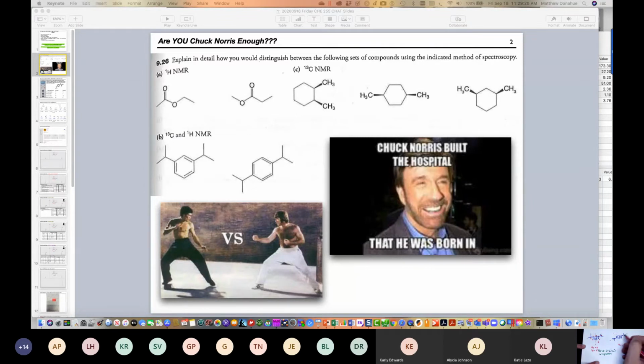So the one axis or plane reduces the count from 12 to lower, and then the second one reduces it even further. So where are the 4? We have 1, 2, 3, 4. So if I number them all with that scheme, there's again a 1, 1, 1, 2, 3.